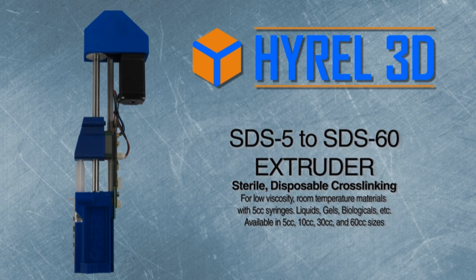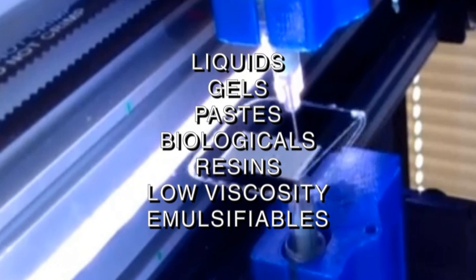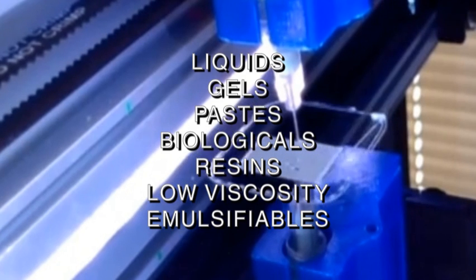The SDS-5 takes a 5cc disposable sterile syringe and industry standard luer needles. This head is also available in 10, 30, and 60cc's. This is ideal for low viscosity, room temperature emulsifiables, liquids, gels, including biologicals.